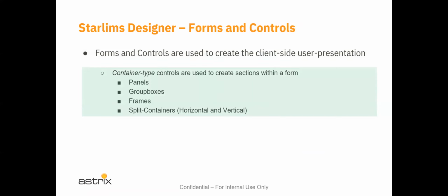The form itself generally doesn't do anything other than it has some events associated with it upon loading, upon being initialized, upon accepting incoming parameters from another form that may have called the secondary form. So it does some of the high-level functionality associated with a form.